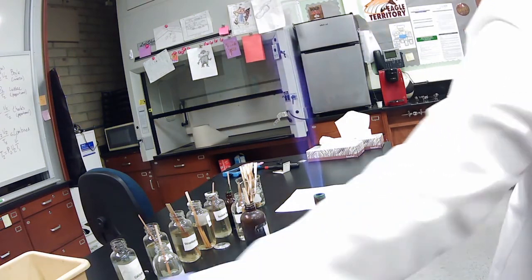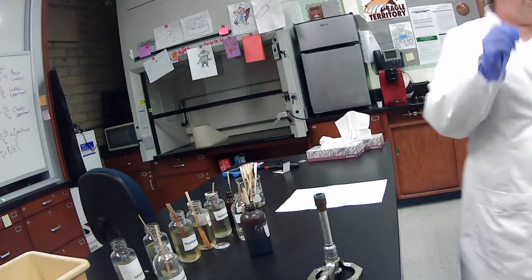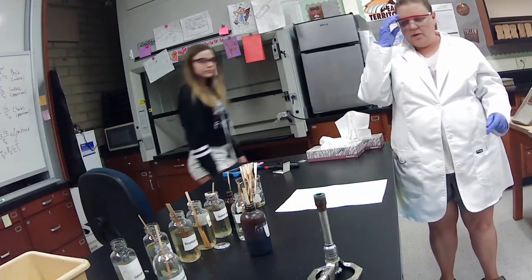And our last one here, unknown C, gives us that hot pink. So nice pink flame. Okay. So this is what happens to our electrons. So as electrons get excited with the heat, they start giving off different colors. So now you should have your entire, at least your color flames done. Okay. So we're going to go ahead, we're going to turn off our gas here, get our flames down. Okay. And then we're going to continue.